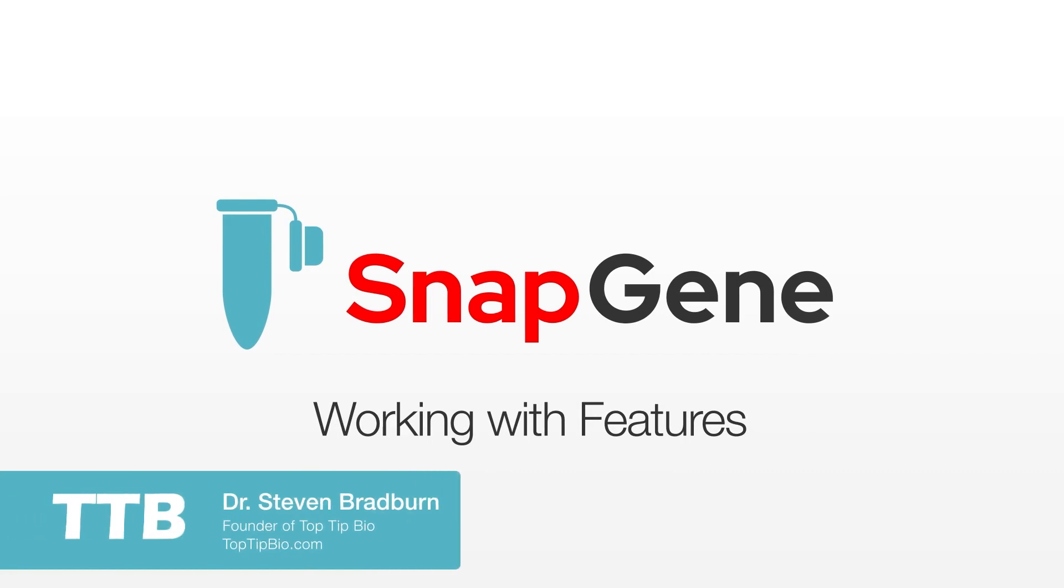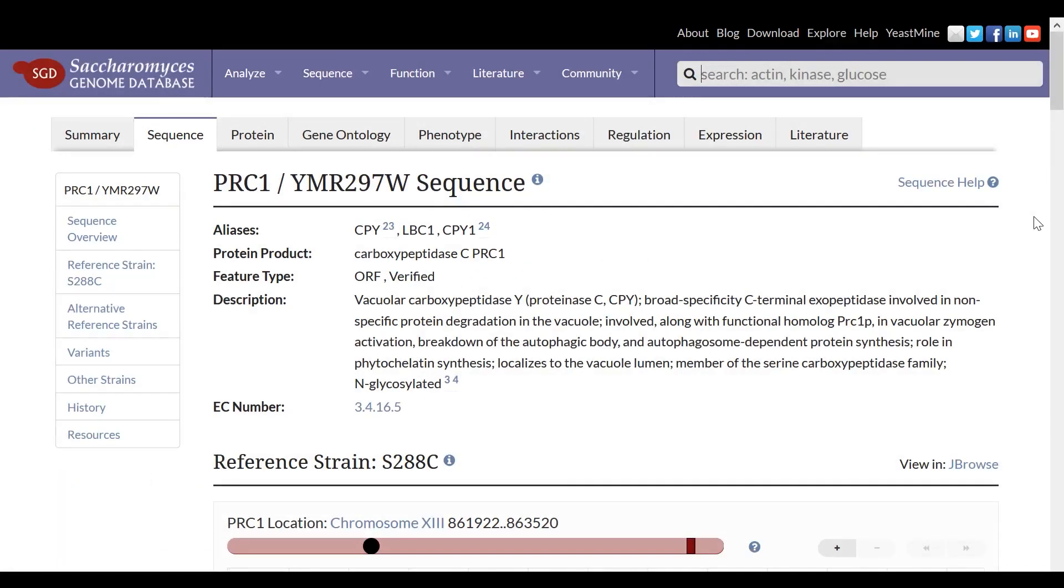In this tutorial, I will show you how you can use Snapgene to quickly annotate specific sequences of interest as features. To demonstrate the utility of features within Snapgene, I will firstly import an example sequence.